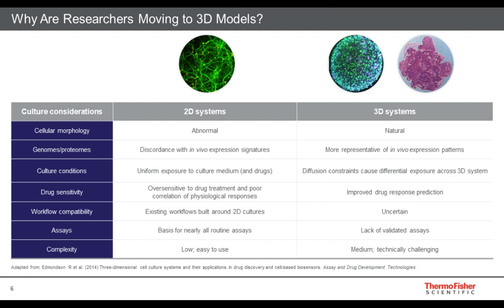And so there is some consideration that one has to take there for optimizing assays. Because they're 3D, it also tends to be somewhat low throughput for various types of imaging analysis, for example, that may require cryosectioning or paraffin sectioning as opposed to simply labeling the entire monolayer culture. So there are challenges like that new scientists to the field should be aware of. This also relates to the complexity of the model, in that although 3D models are more complex than normal 2D models, this also makes them somewhat technically challenging to grow, to handle, and to assay.